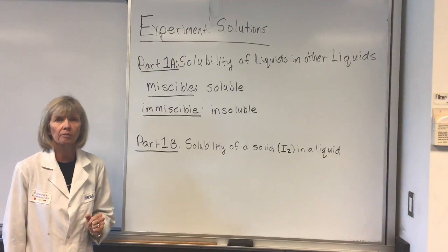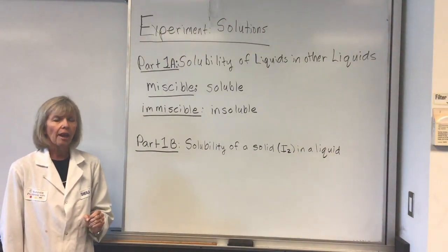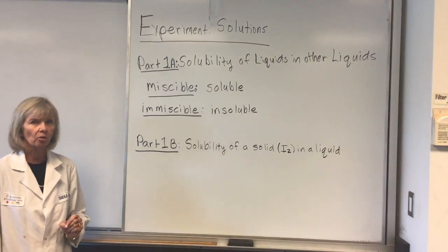In the second part of the lab today, you're going to look at the solubility of a solid in a liquid. And the solid we're going to be using is iodine. We'll have iodine crystals, and you're going to see if they're more soluble in either acetone or water.